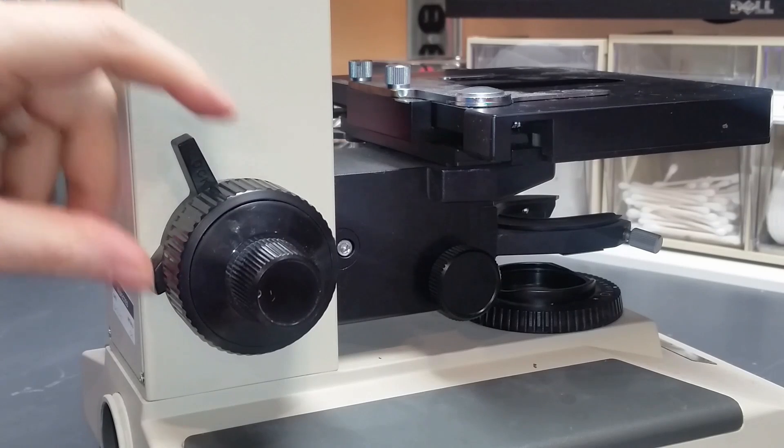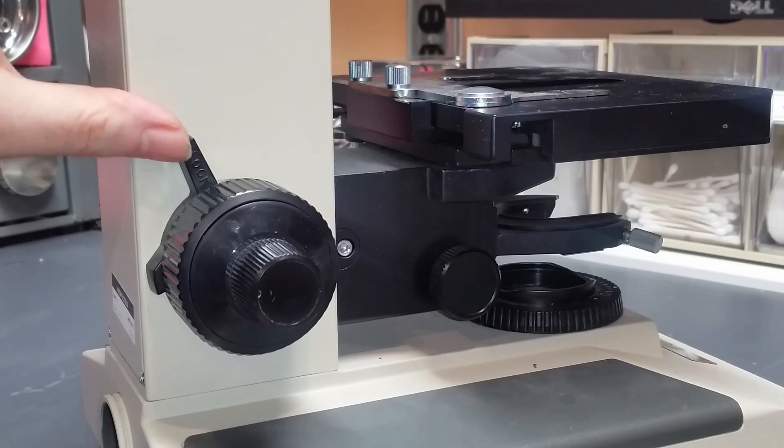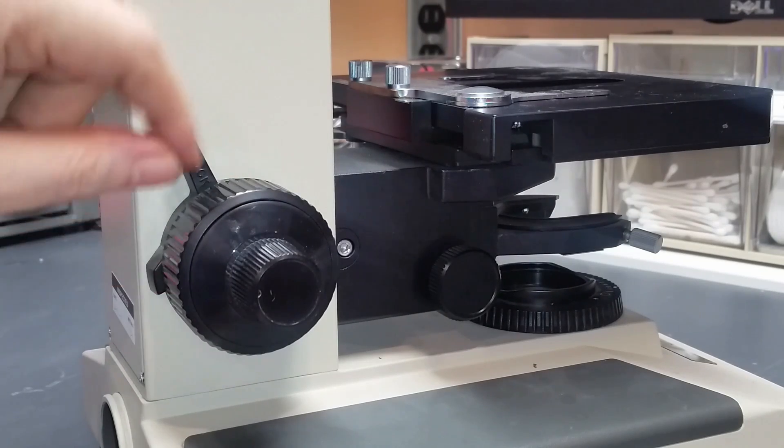So it's nice to have this mechanism working. I get a lot of questions about this mechanism — like what is it for, how does it work, and sometimes more importantly, how do you put the thing back together once you take it apart.